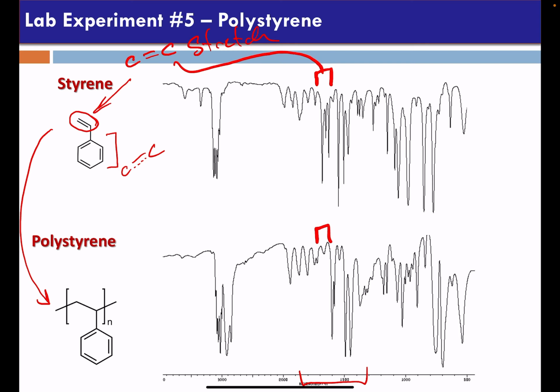Okay, other signals that are shown here correspond to an overtone set of signals due to the architecture of a singly bonded phenyl group pendant to this main chain.